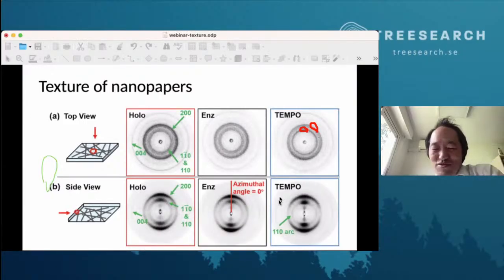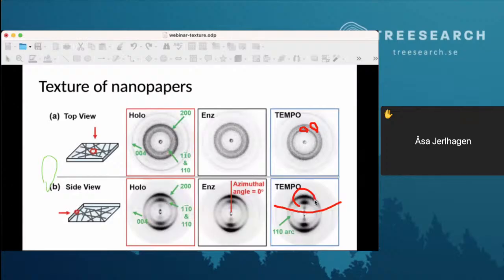Yes, because when you do X-ray shining perpendicular to the film, what you're doing is actually cutting this plane like this. So you're looking at the intensity in this direction. You see this one very strong, because your Ewald sphere is cutting here. You are completely neglecting those. So you see a cut, like the orientation also impacts the top view data.